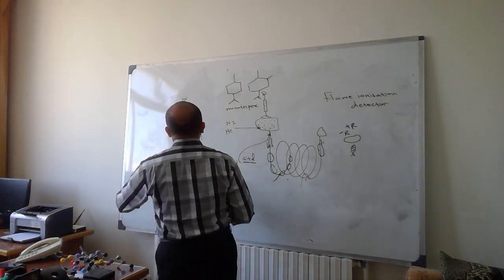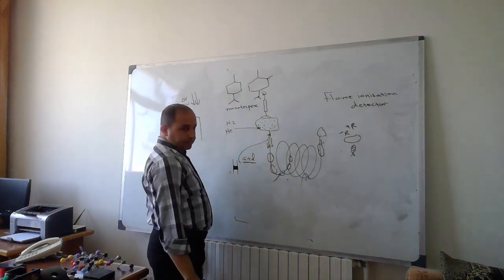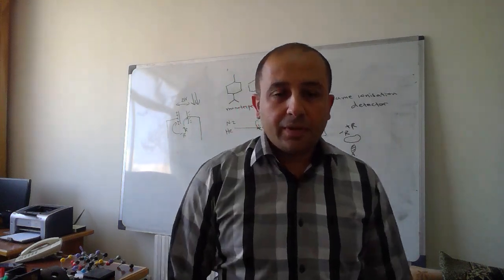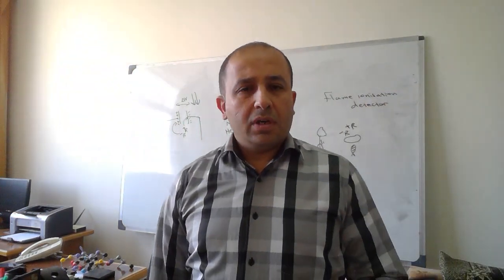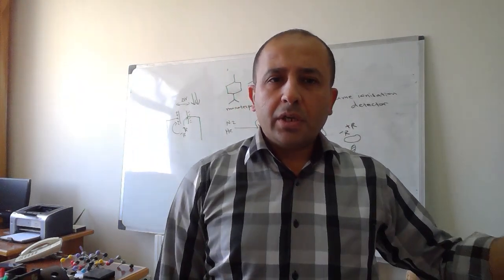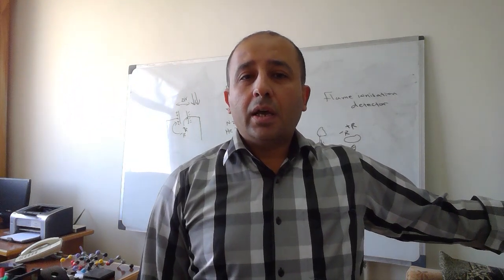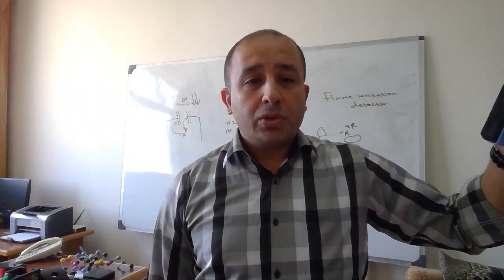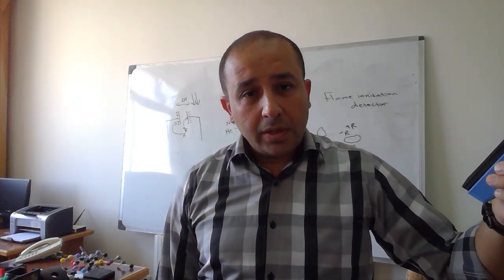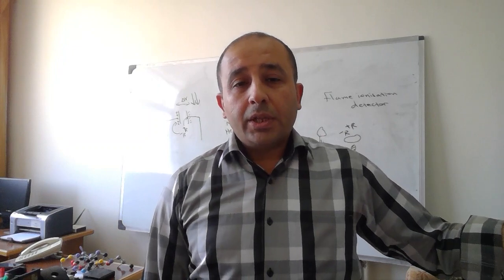So the voltage will also be reduced, because you can think of voltage as energy, which equals force multiplied by displacement.